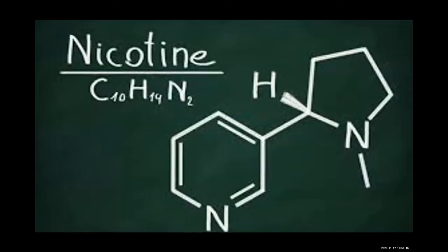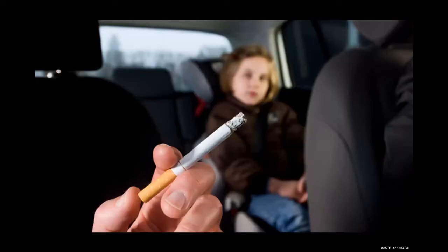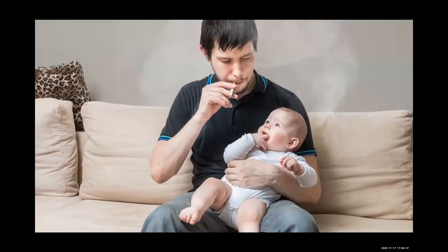The addictive nature of nicotine and the impact of cigarette smoking on the health of smokers has been extensively studied for decades. In more recent years, the effect of so-called secondhand or side stream smoke inhaled by non-smokers has been evaluated and is now recognized as a significant issue for indoor air pollution. This laboratory investigation focuses on studying the smoke inhaled by smokers as well as side stream smoke.